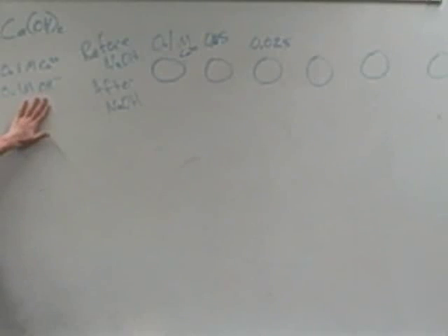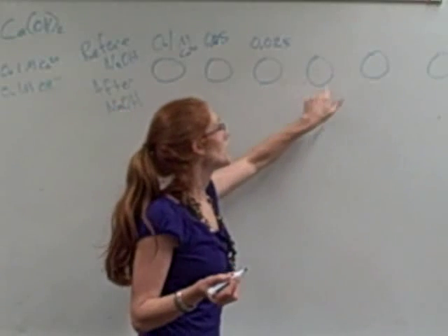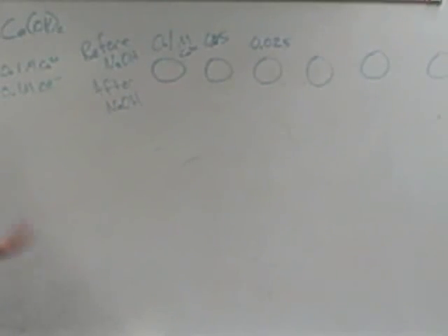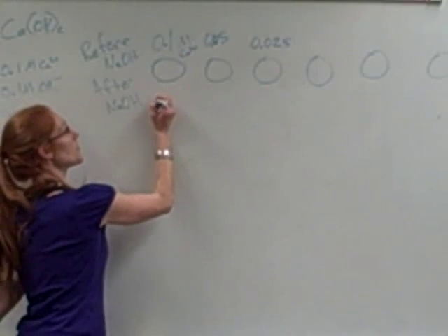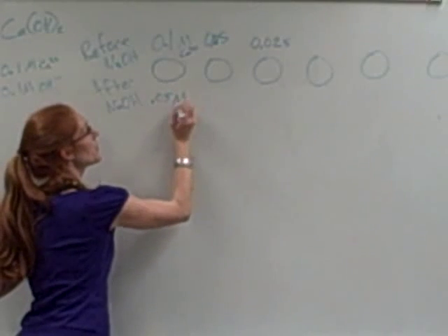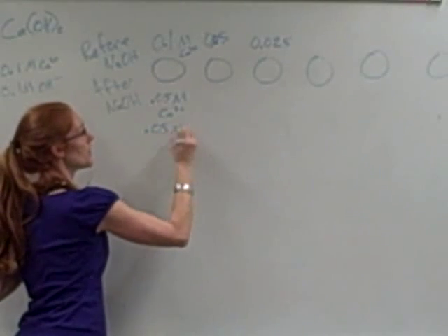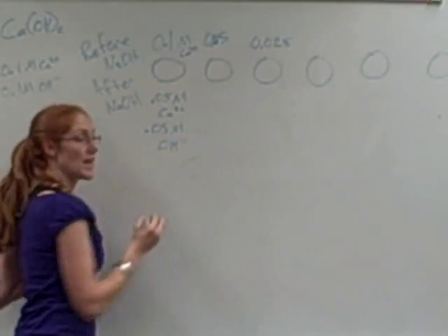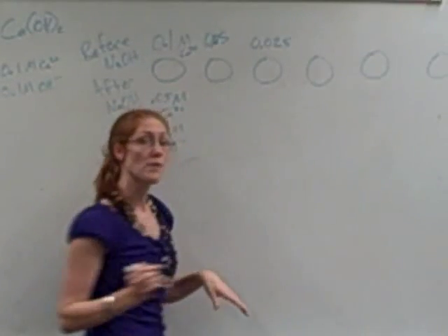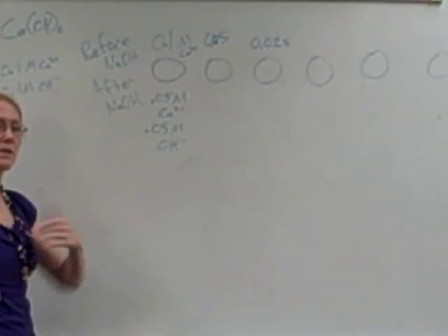Then I'm going to add my sodium hydroxide, so I'm going to go 5 drops of hydroxide, 0.1 molar in each one, and as I do that, I'm doubling the volume again, so I'm halving the molarity again. So this 0.1 molar is actually going to be 0.05 molar calcium ion and 0.05 molar hydroxide ion, because I have both molarities. All of these are actually going to be 0.05 molar hydroxide because we had 0.1 molar for each well and then we doubled the volume.